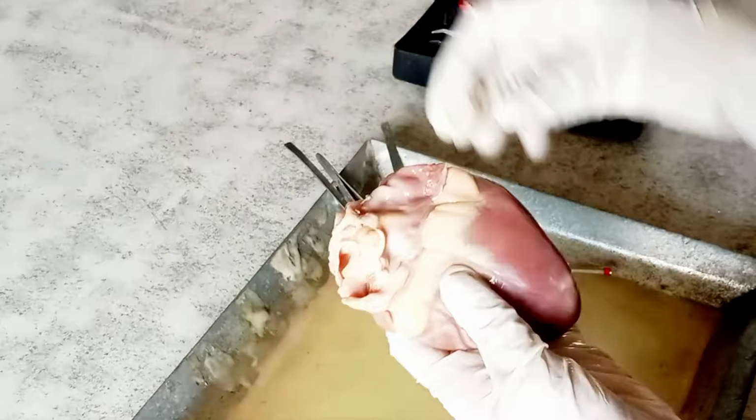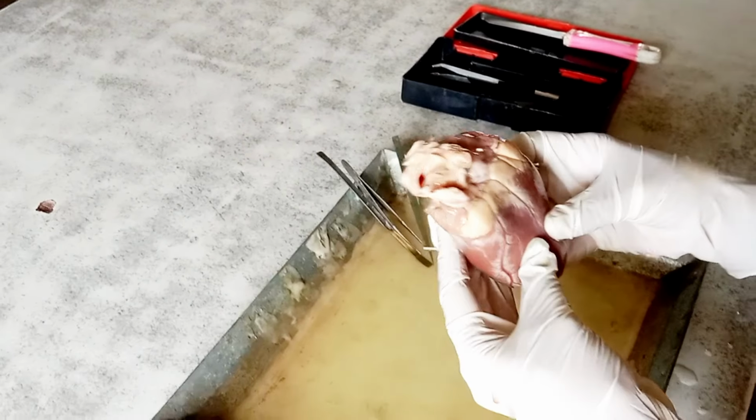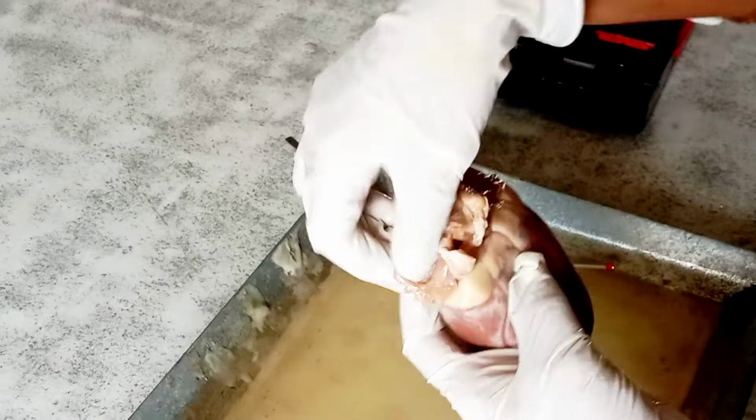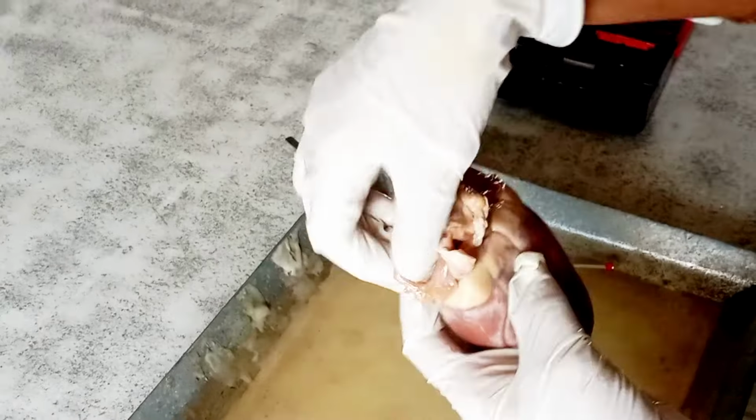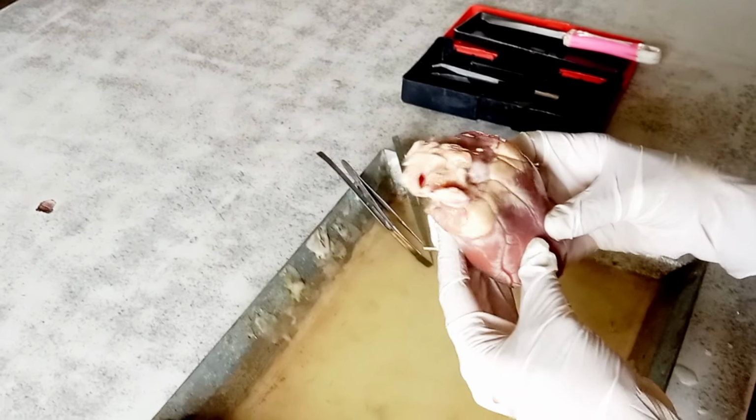You know that blood carries oxygen, nutrients, hormones, etc. and also collects waste. So, heart is pumping the blood not only to all the organs of the body but also to itself. So, these blood vessels which carry blood from the heart to itself and vice versa are called coronary arteries. You can observe here.